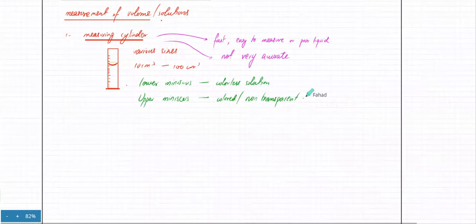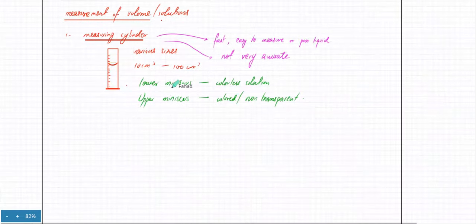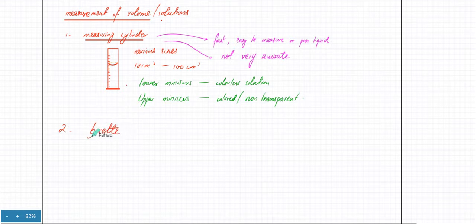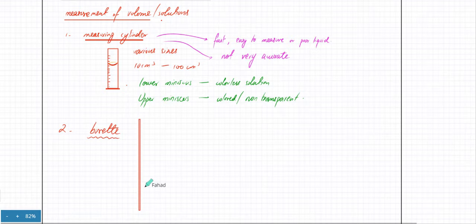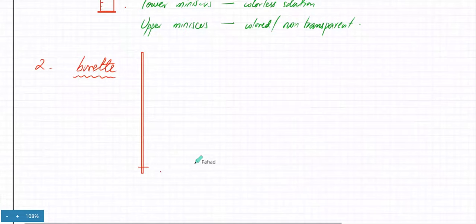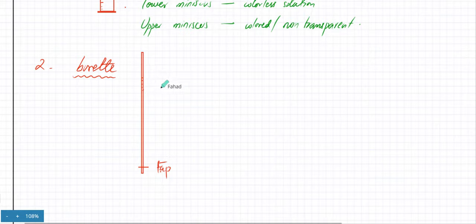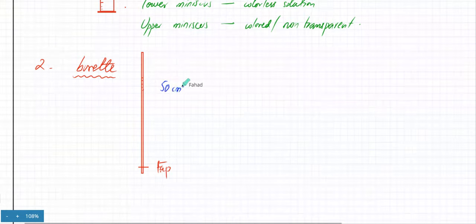That's the rule for the measuring cylinder. The second device is a burette. A burette is a very long cylindrical device with a tap at the bottom. The tap can be opened and closed. The burette has many graduations on it, and its total capacity is usually 50 cm³.